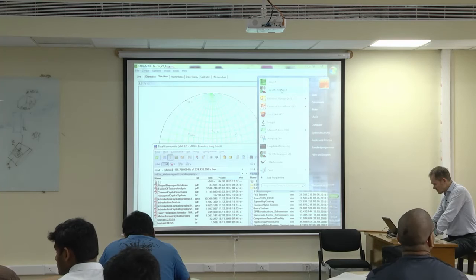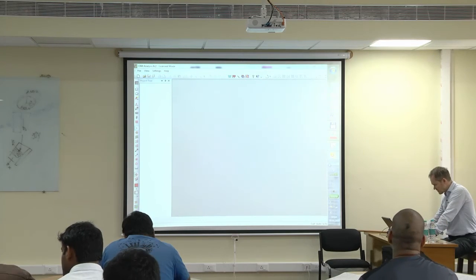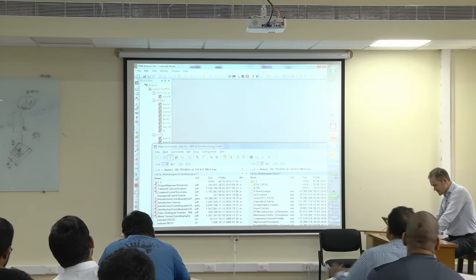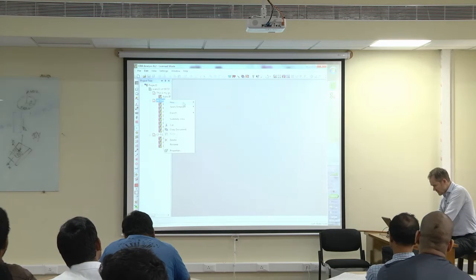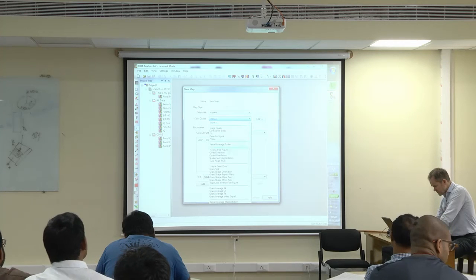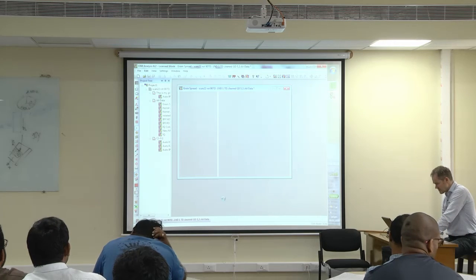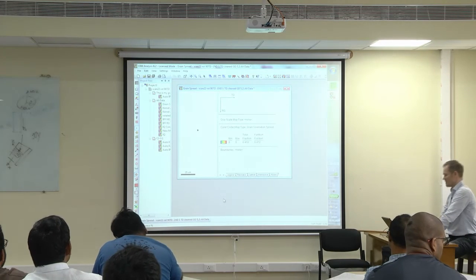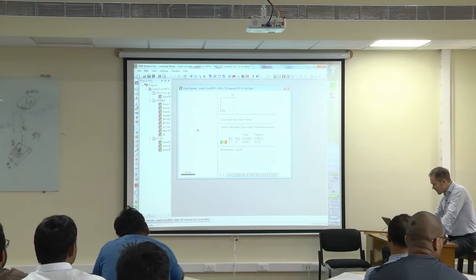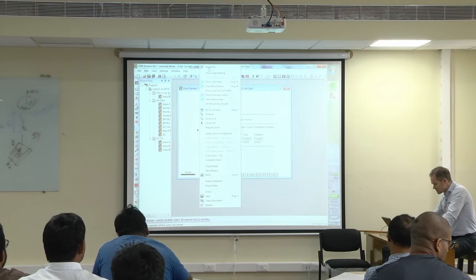Let's try the other version of OIM, version 6. Perhaps it works with this, but I'm not sure whether I can load these data in there. Let's see. Yeah, it is. Let's try it again. And this is grain orientation spread, and okay. Nah, it's the same thing. Verdammt. I don't know what is wrong. That's certainly a bug, but I don't know why this appears suddenly.